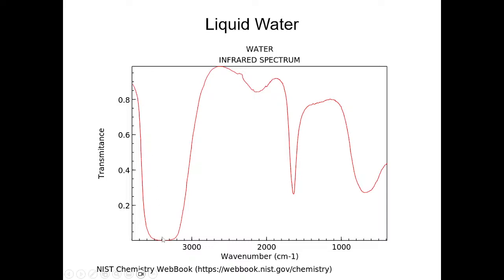So nothing reached the detector in this energy range. And by the way, wave numbers are a measure of the wavelength, but inverted. That means that this area in the 3000 something wave number range was absorbed. So water was able to use this for a transition in vibration.